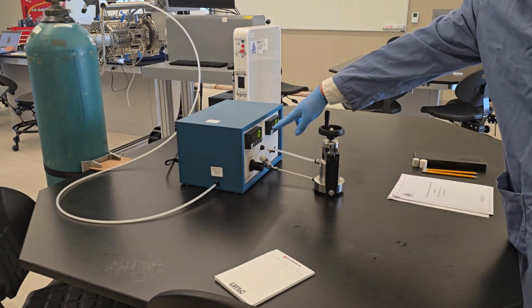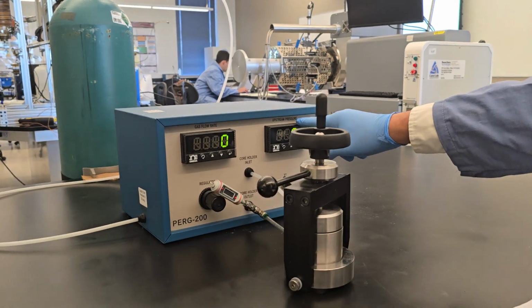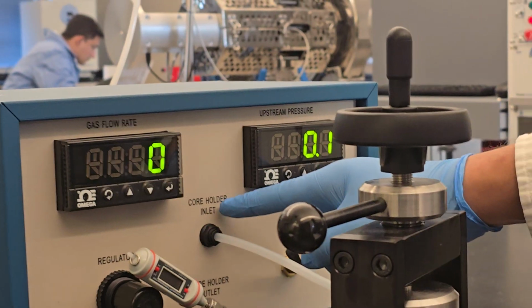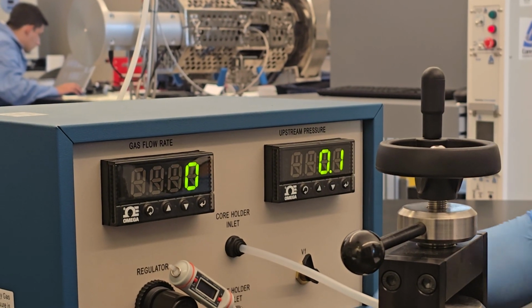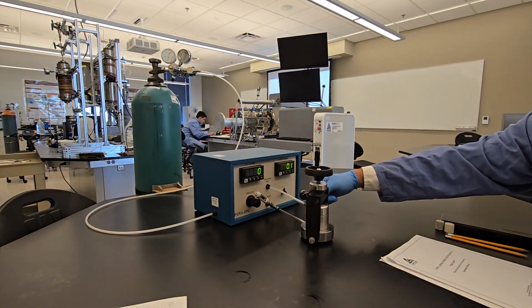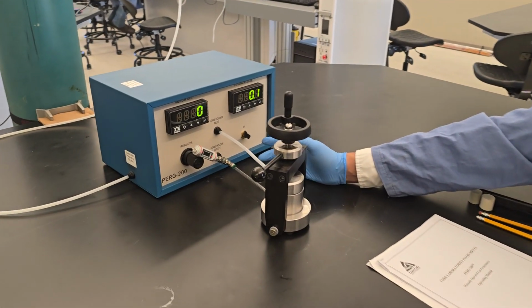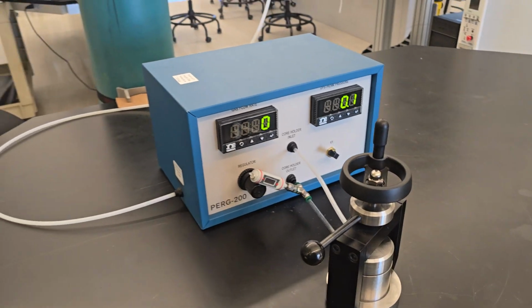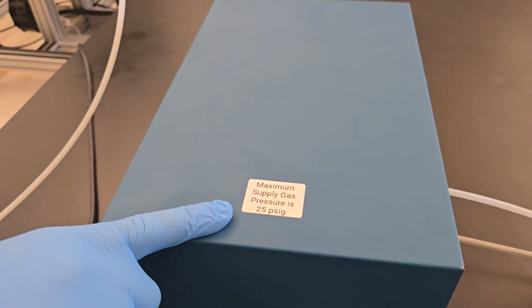So you can see we here have two gauges. That first one reads the upstream pressure, and that one reads the gas flow rate. So the upstream pressure predicts how much pressure is going into the sample, and the gas flow predicts how much gas flows out of the sample. Now this is the upstream flow pressure, and the downstream pressure, it's open to the atmosphere, so it's 1 atm or 0 psig. This is for your information to do the calculation. So as you can see here, it says the maximum supply gas pressure is 25 psig.